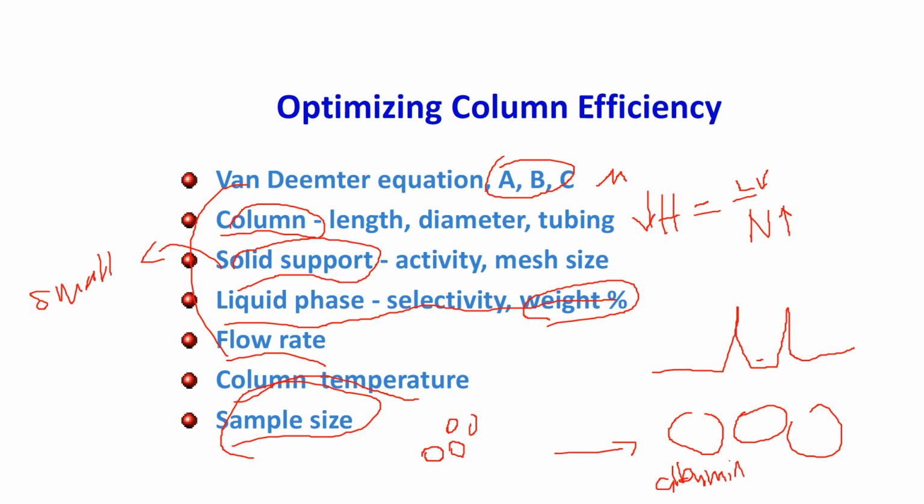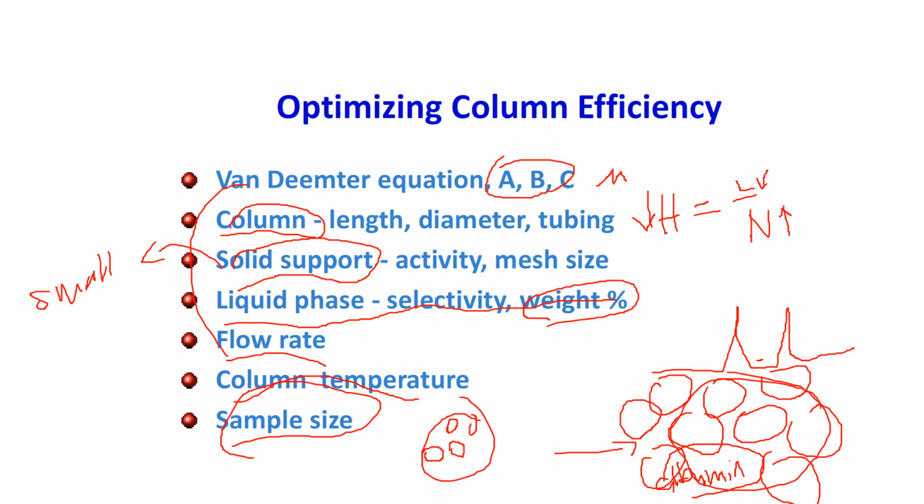So what is the albumin? Albumin is quite abundant in protein-based food such as eggs. So this albumin is really big. That's why you can see it inside those eggs. So imagine if you separate very big albumin as compared to a small drug, you will expect to see a very broad peak as compared to this one. And of course, this is high N and this is low N.